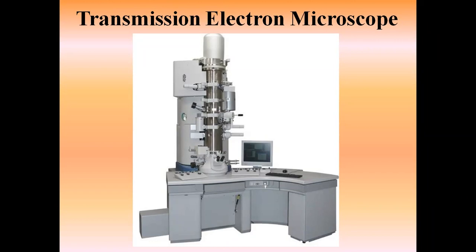Whereas in the scanning electron microscope, the surface is scanned throughout with the help of the electrons.